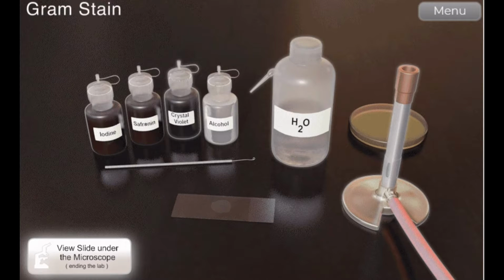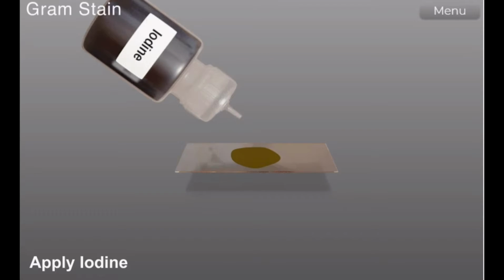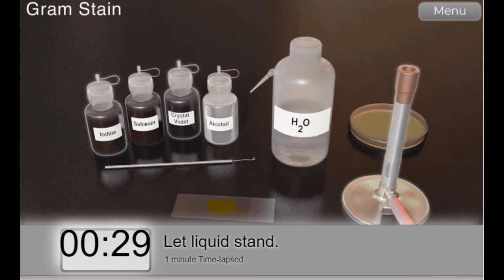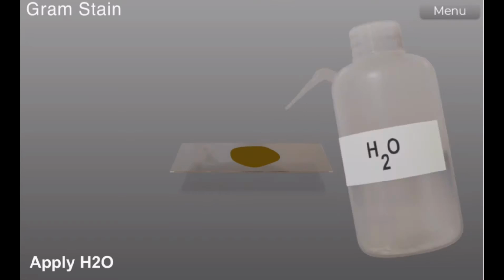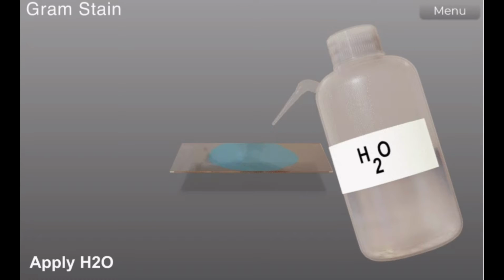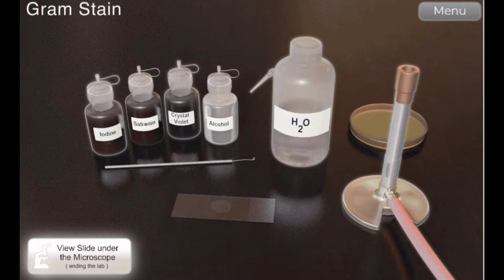After rinsing with H2O, we will flood the slide with iodine for 1 minute. Rinse with H2O again. And we will decolorize with alcohol for 5 to 10 seconds.